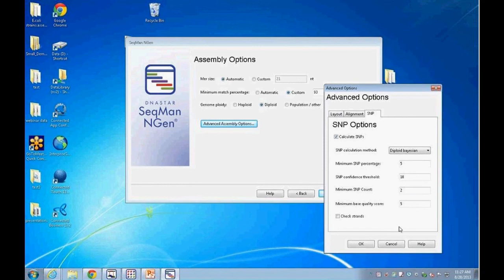So what these filters are used for is they are upfront filters that will remove much of the sequencing noise. All of these next-gen data sets will have a significant amount of artifact due to errors in the sequencing. So we apply some minimal filters that can remove the sequencing noise from the SNP files. At these scales, when you have millions of SNPs potentially, the SNP files can be pretty large and unwieldy.